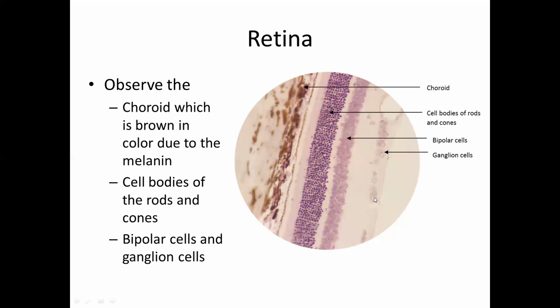Now the fibers are too thin to be seen in this preparation, but you can see the cell bodies of the neuron layers. So these are the bipolar cells, and finally you can also see the superficial most, the ganglion cells, right? When you look at a section, this is of course at 40 times magnification, you get this view of the retina. The other layers which are in between cannot be visualized clearly because they are very thin and fine.